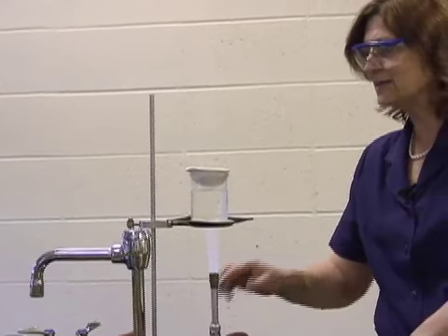Now the difficulty in this part is that we cannot see water molecules. And it may have the appearance of being dry, but yet it's not dry. And therefore, we're going to time this for 5 minutes so that it continues to dry. And if our mass comes out to be too high, which I can tell because I have the empty mass, and then I'll make my subtraction and see how close I'm getting. If it's way, way too heavy, I know there's probably still water in there and it needs to be heated longer. So I will go ahead and heat this and dry it up, and I'll see you in a moment.